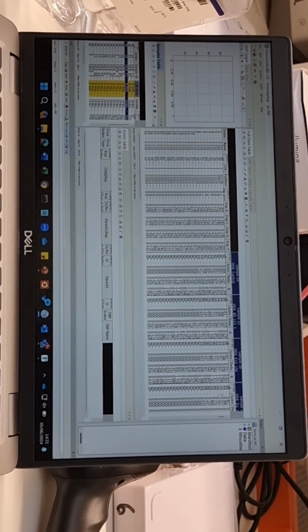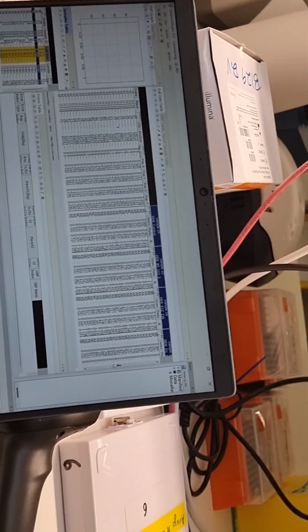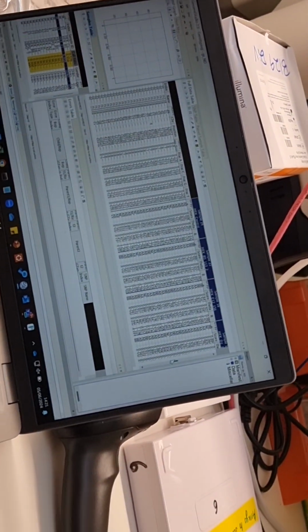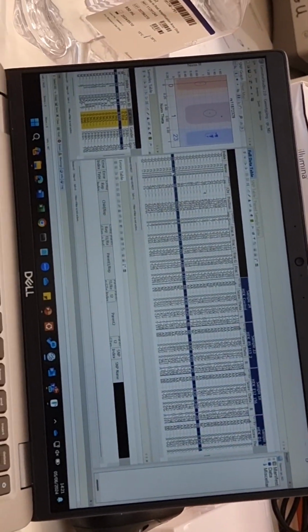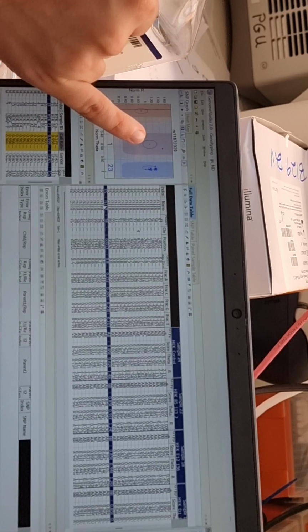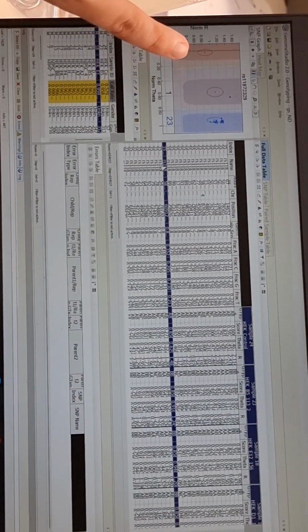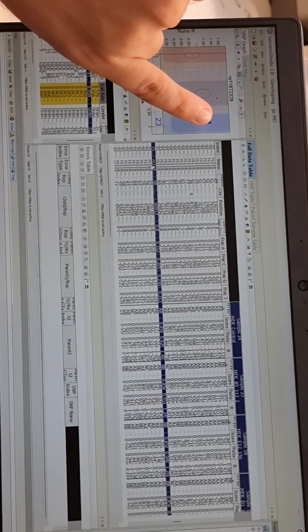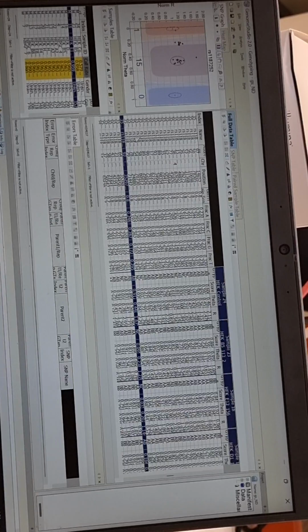Then check the clustering as well, just to make sure that's right. You'll probably need to go down to where you see the RS numbers, the individual SNPs, and click on a couple of those to check the clustering. The little cross in the middle is the true value for that genotype. The clustering's slightly off, but it's probably because you're using a CRISPR edit.